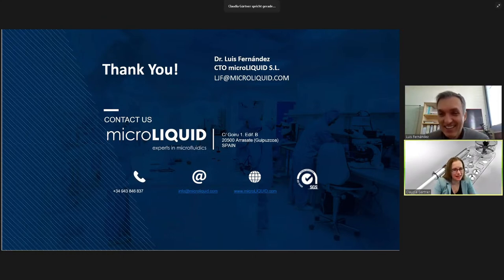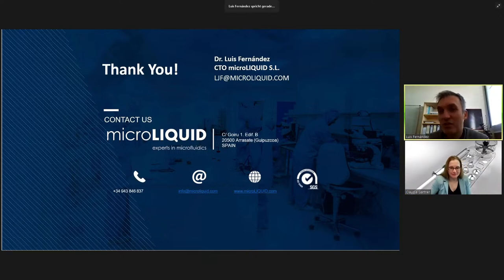Chip, two blisters, and give that, I simply want to drive group here from the idea that microfluidics is a $1 business when you have some more complexity involved. Well, it will never be $1 when you are integrating blisters already, because blisters are not cheap even by themselves. So it will always be in terms of a few euros. I think we already touched this subject. I completely agree. It will be very difficult to get a really passive microfluidic component which targets the $1 market.